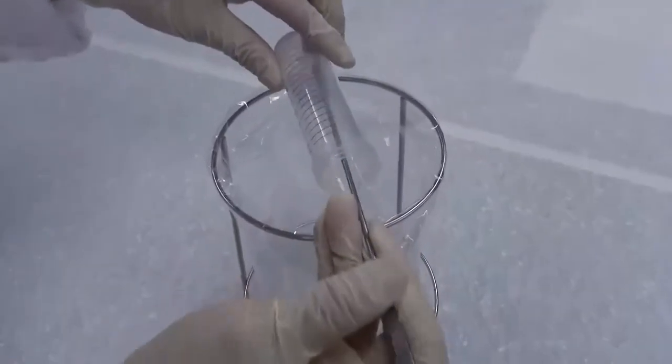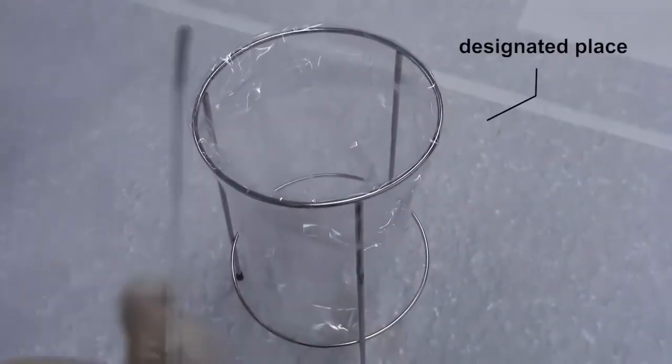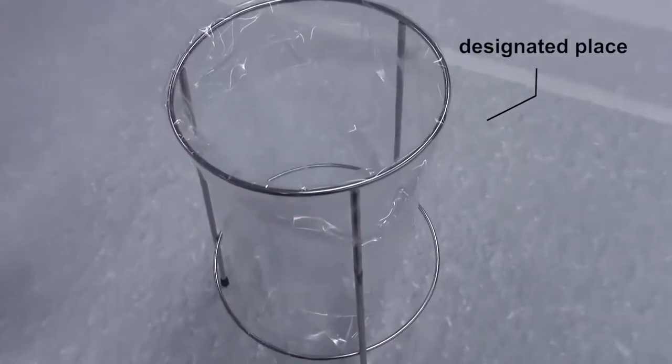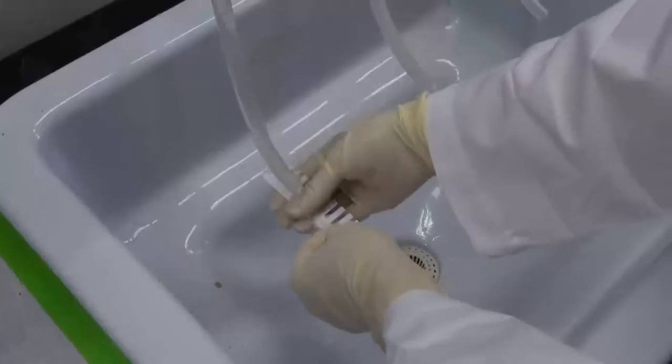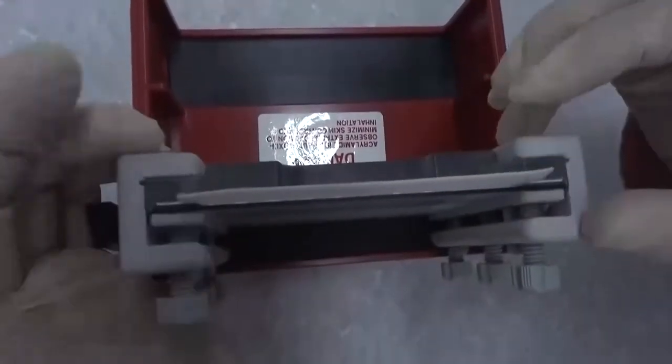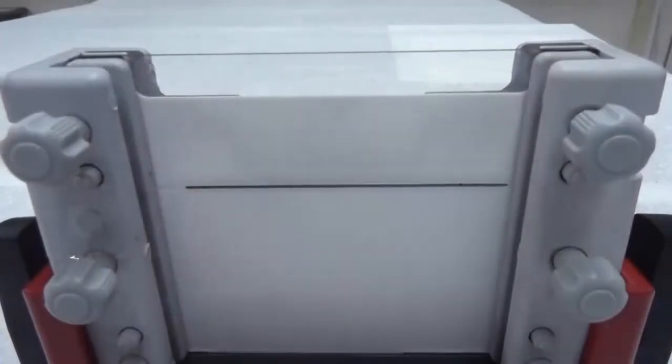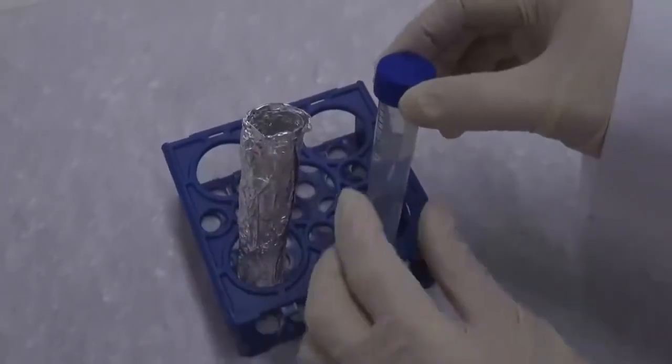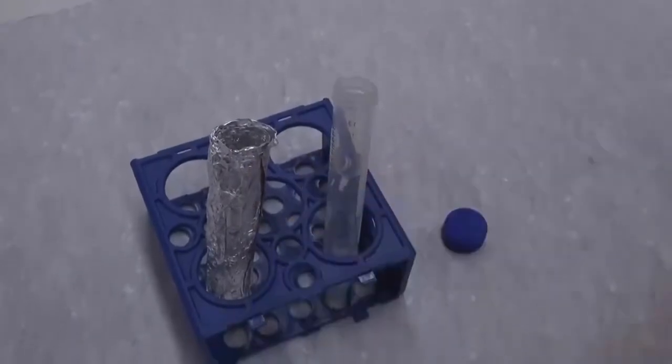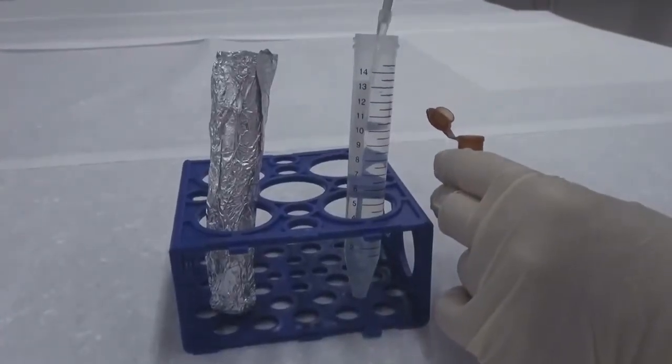The gel solution that has not polymerized completely is still toxic and must be disposed at designated places. After the lower gel polymerizes successfully, preparation of the upper gel may start. Wash and dry the comb, make it flat, and insert it between the plates for testing. If everything is good, pull the comb out for later use. Again, take the centrifuge tube containing the upper gel solution and open the lid. Add proper volumes of TEMED and APS into the gel solution. When the temperature is low, the volume of APS may be doubled.